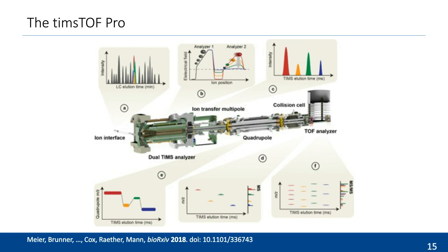The timsTOF supports this PASEF scan mode fully and automatically selects the precursors in all the dimensions. There's been a lot of technological innovations going into this development. One of them was to, first of all, select the precursors with an algorithm in real time. The other one was how to set the quadrupole fast enough so that we can actually sequence as many peptides as possible in a short time.